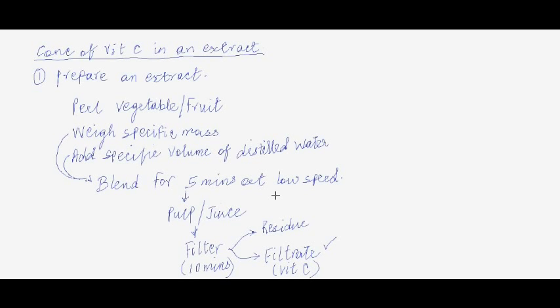Now, once we've got the extract, we must remember, if we are comparing different fruits, the procedure for preparing the extract for each type of fruit should be more or less the same, so that we get valid results.